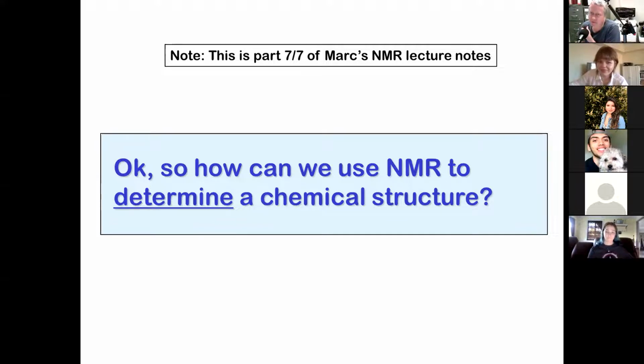And if you don't do it the right way, it is horribly terrifying. But there's a systematic process that we can use that works almost every time. And I have to teach you that process. I don't think the book actually describes a systematic process, so this is what I came up with. I actually came up with this in grad school in Santa Cruz, as a way to teach this. It's fun. It turns it into a puzzle. All you have to do is figure out the pieces of the puzzle, and then you've got the structure. That's pretty much it, right?